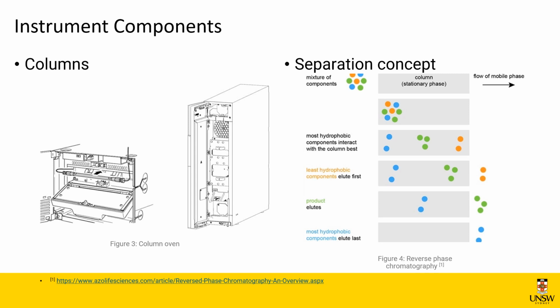It is also important to note that solutions with solid particles or precipitates are not appropriate for HPLC, as they can damage the column or cause pump pressure and flow to become unstable. Therefore, the complete dissolution of samples is necessary.